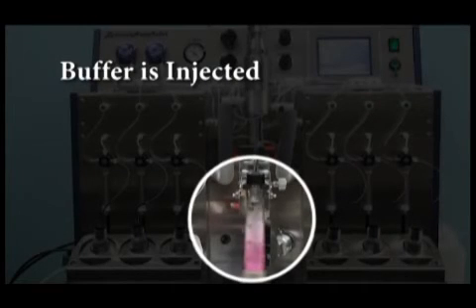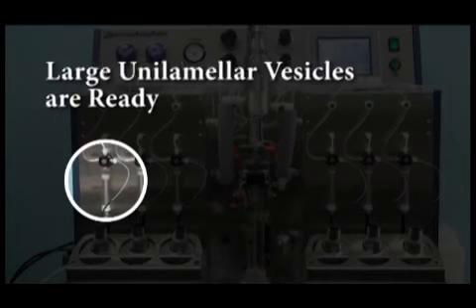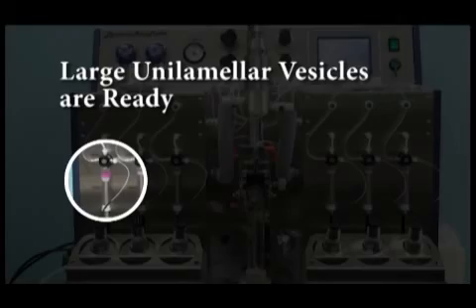Next, the buffer is injected into the test tube and vortexing is continued under the appropriate temperature and reduced pressure. Large unilamellar vesicles are prepared and ready to be dispensed.